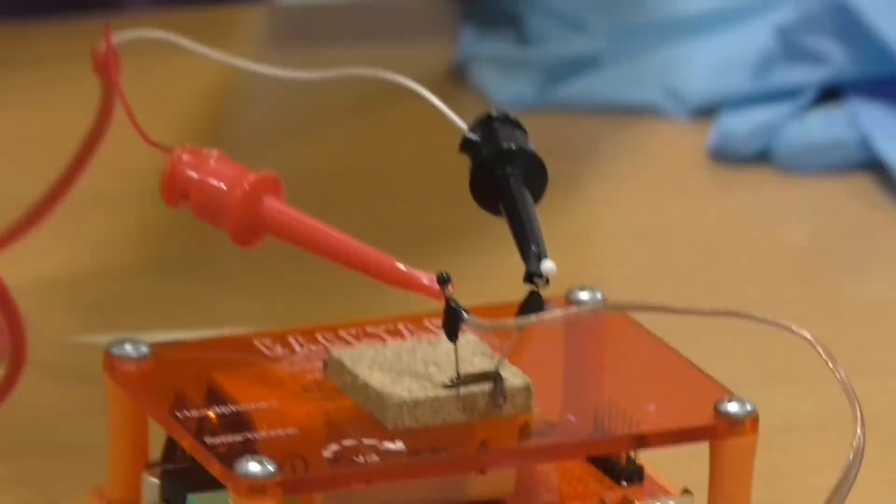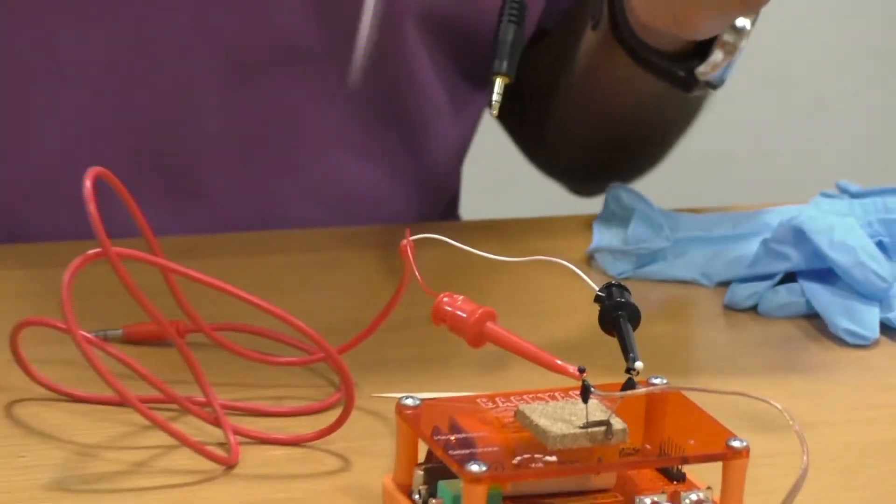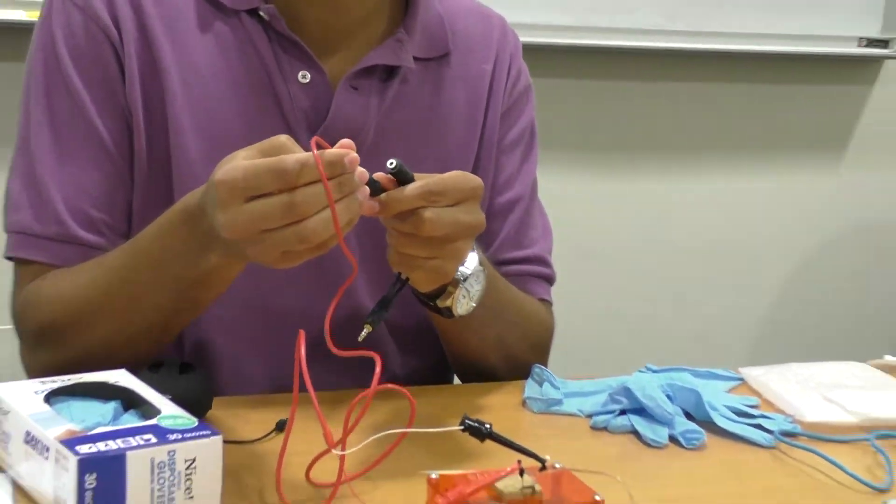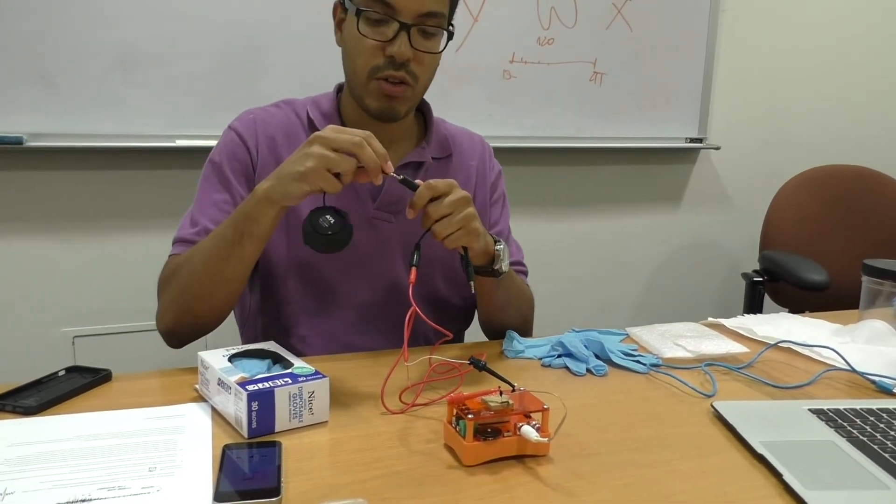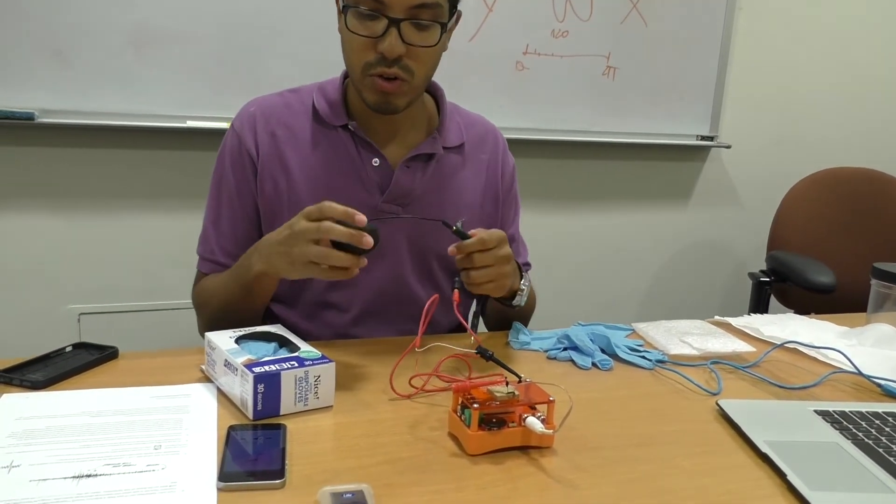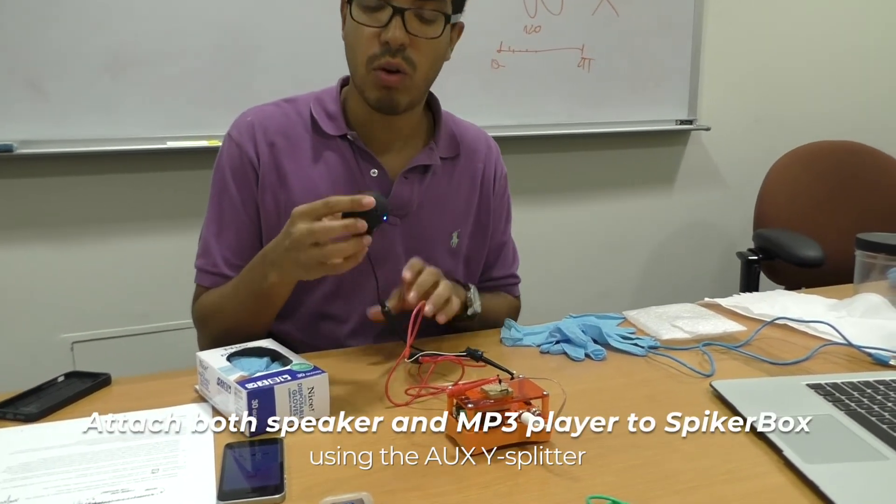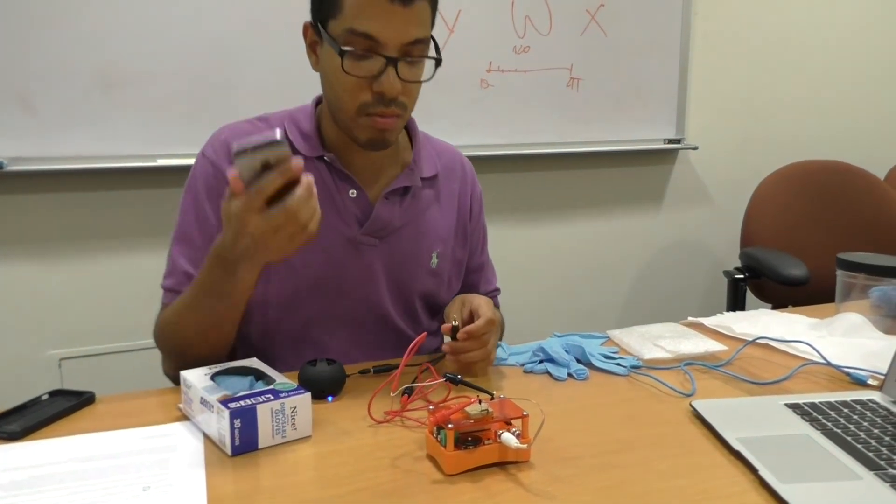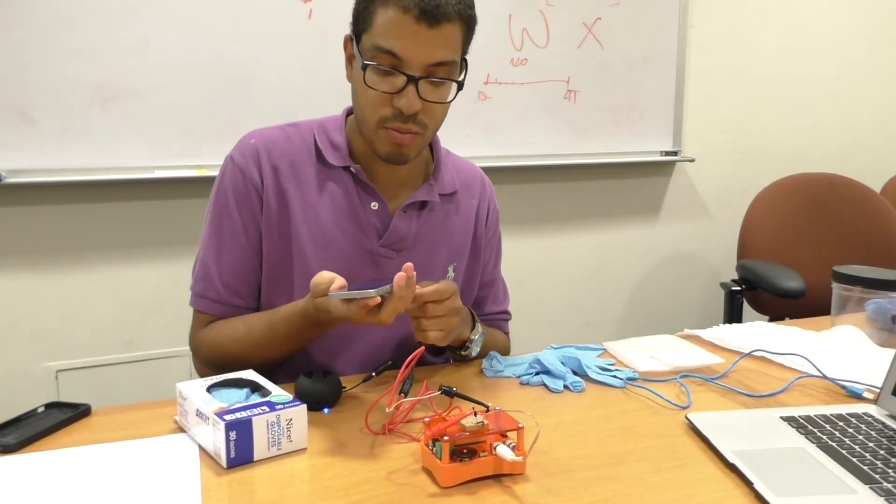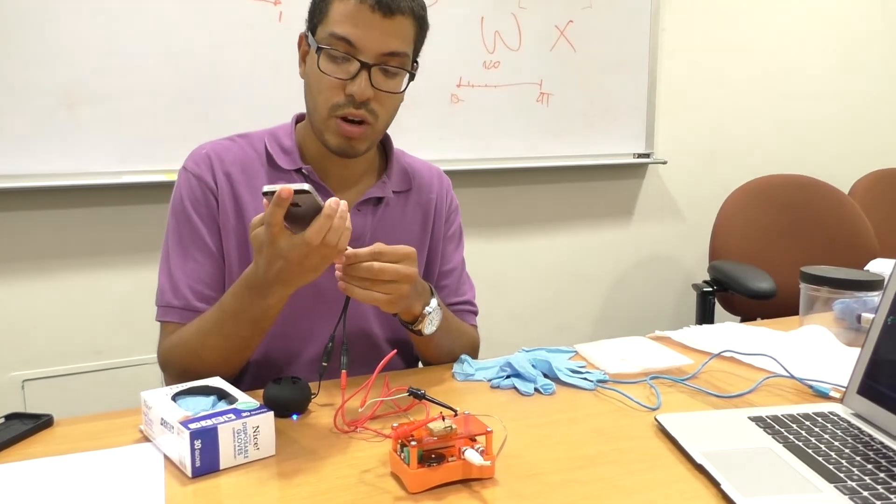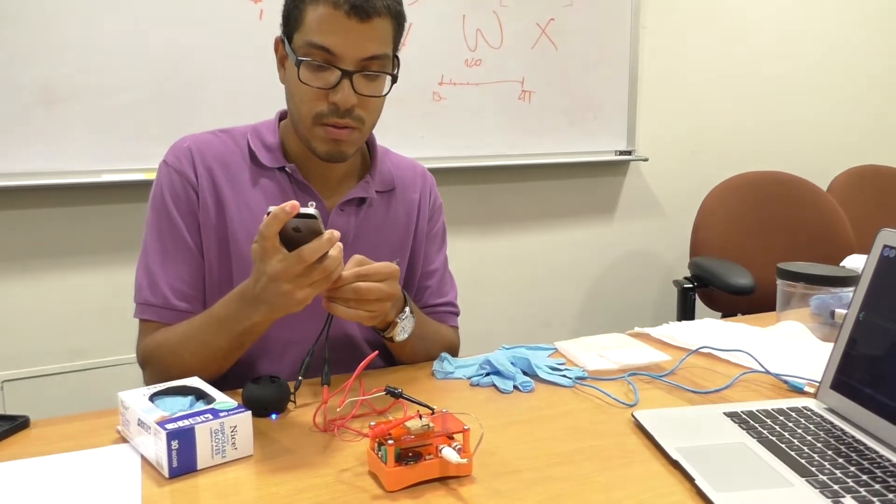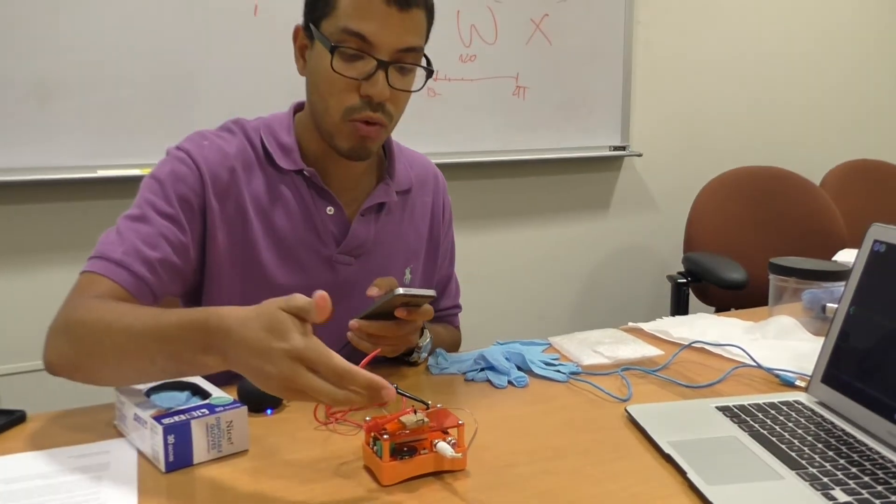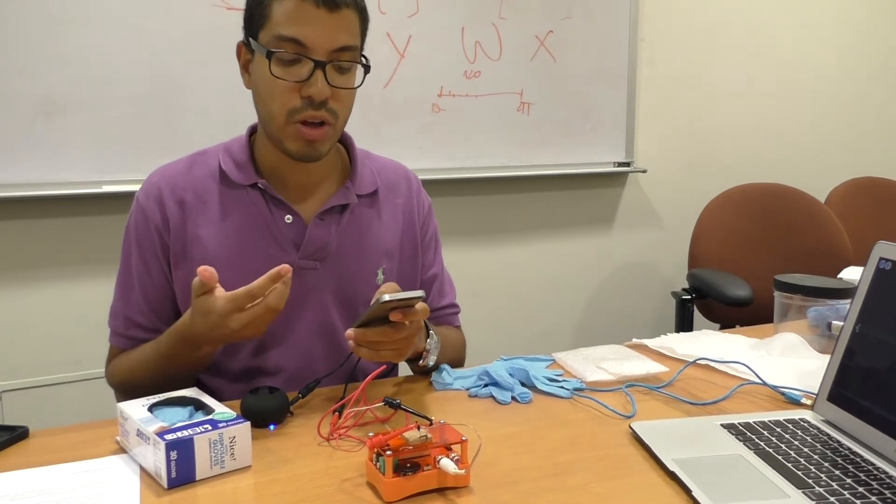And you can actually turn off your SpykerBox at this point. And then using the splitter that we've provided as well as your speaker, you'll plug the red stimulation cable into one half of the splitter and the speaker into the other half. Remember to turn your speaker on. We do this so we can hear the audio that we're playing from our device. So using a mobile device, a cell phone or whatever music player you have, you'll plug that into the third end of the splitter. And then starting at a low volume, because we don't want to over stimulate the leg at first, you'll start playing a song.